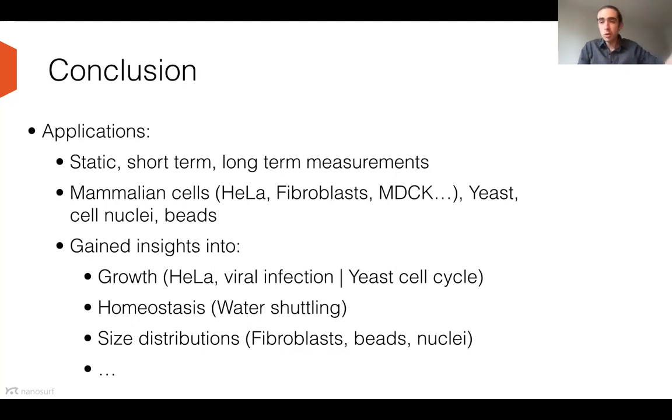There are, of course, way more interesting research questions that can be posed with that instrument. It has a very high resolution and is compatible with light microscopy, so you can do other assays at the same time. Everything is also happening in cell culture conditions, so the cells are not affected by your measurement. There are many things you can do with these few conditions I just mentioned. So maybe we can now discuss some of these applications that you have in mind, or the instrument and its functionality.